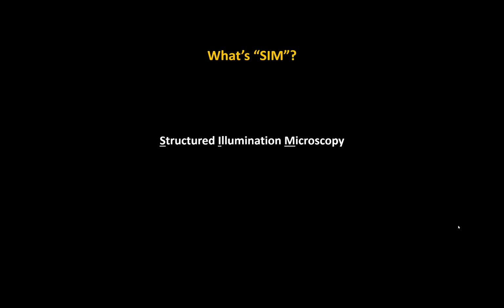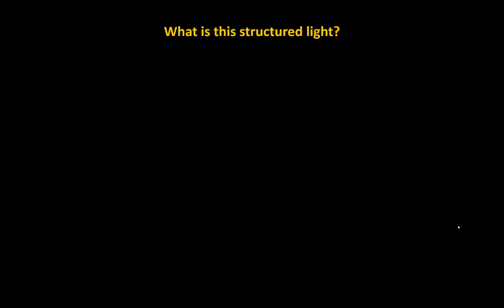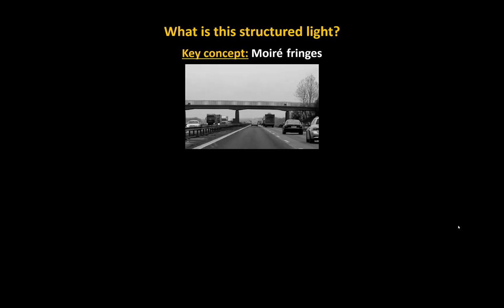SIM stands for Structured Illumination Microscopy. Its whole modality is based around structured light. So what is this structured light? The key concept for understanding this is actually something called moire fringes, which is something you can see every day. Basically, one example that you might see is on the highway or interstate.